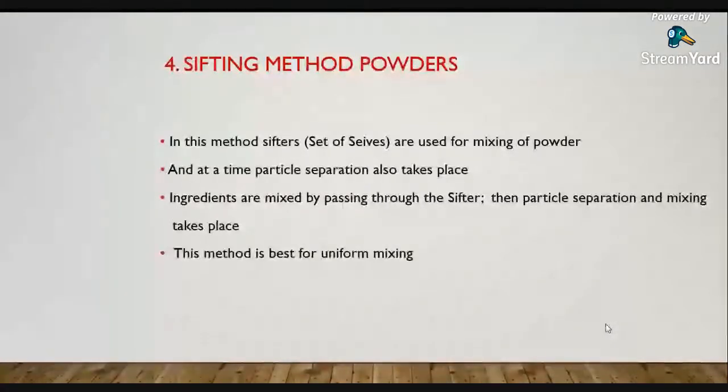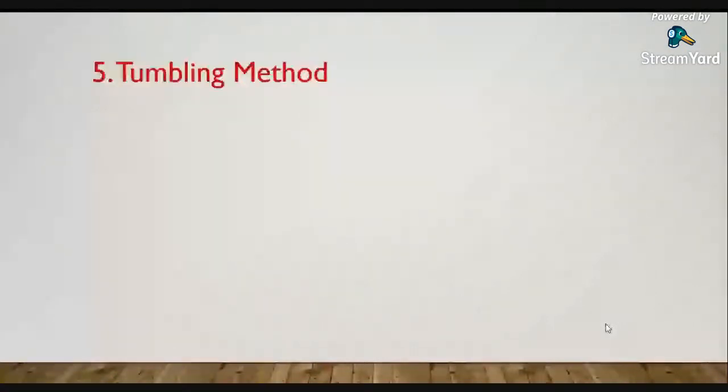And this is the best method for mixing of powder also. It is also used in large size powder manufacturing. But it has a limitation that it is not suitable for potent drugs. Potent drug साठी तो suitable नाही आहे.